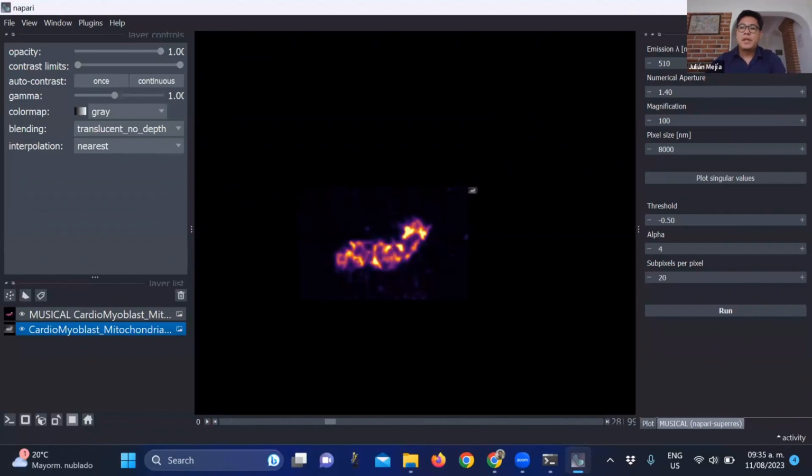Thank you, Tobias. Monara, you have a question as well. Yes, about the video, I was waiting to ask that. Is the video you create based on the Z stack, or do you do acquisition through time to make the video for this analysis?